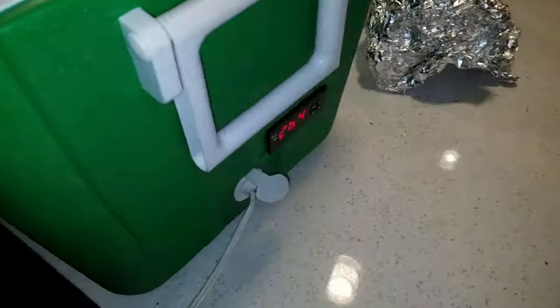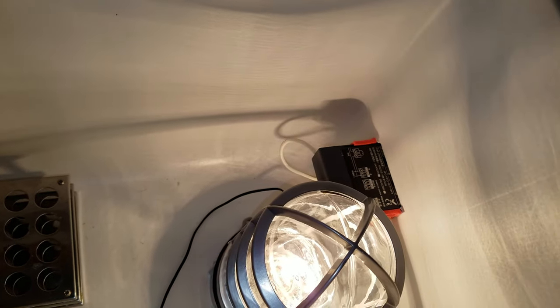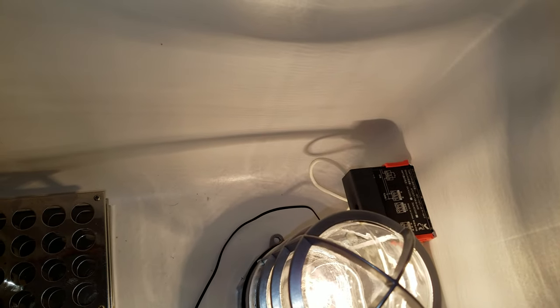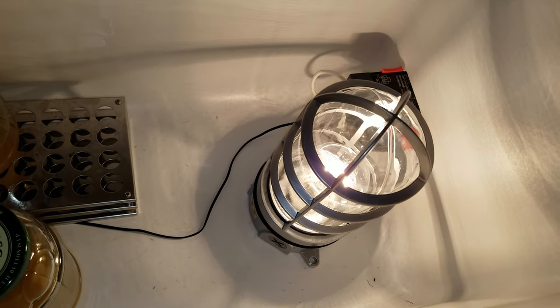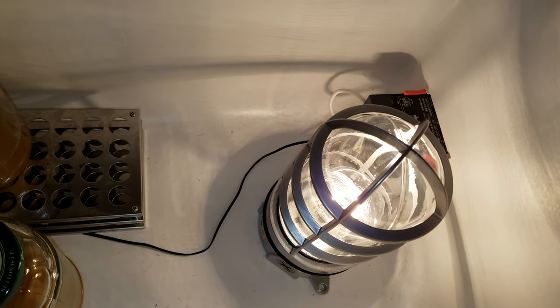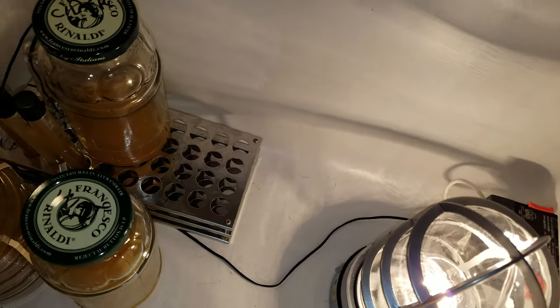The temperature controller here goes into the STC-1000. The wiring goes into the STC-1000. The heating element is the only part that's hooked up — it goes to the light bulb. The cooling you obviously don't need because it's going to be above room temperature at all times, so you only need to heat.